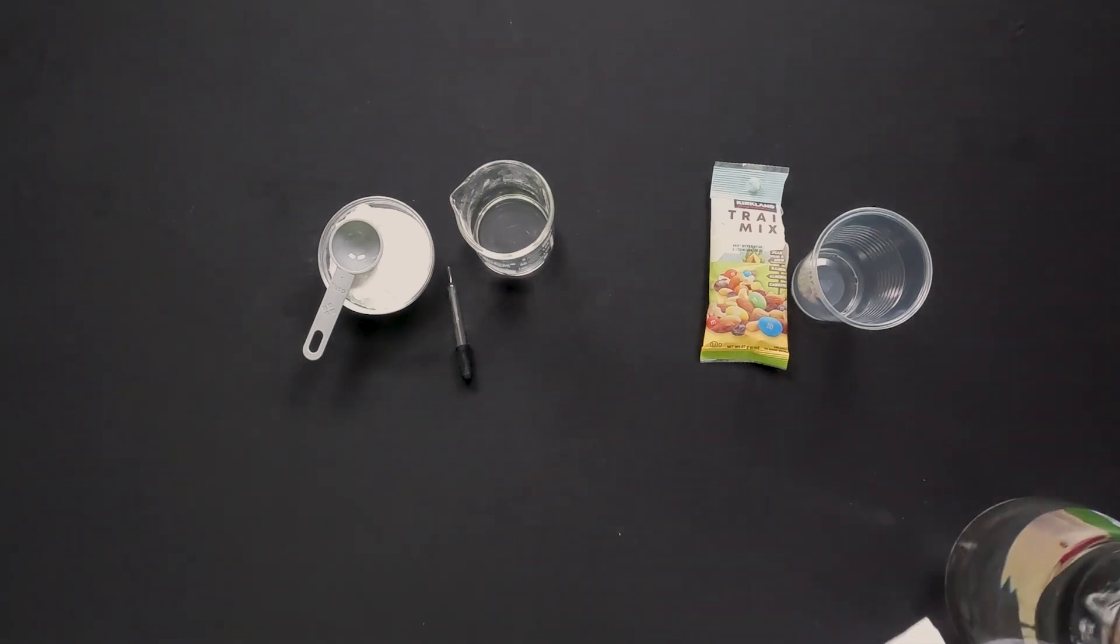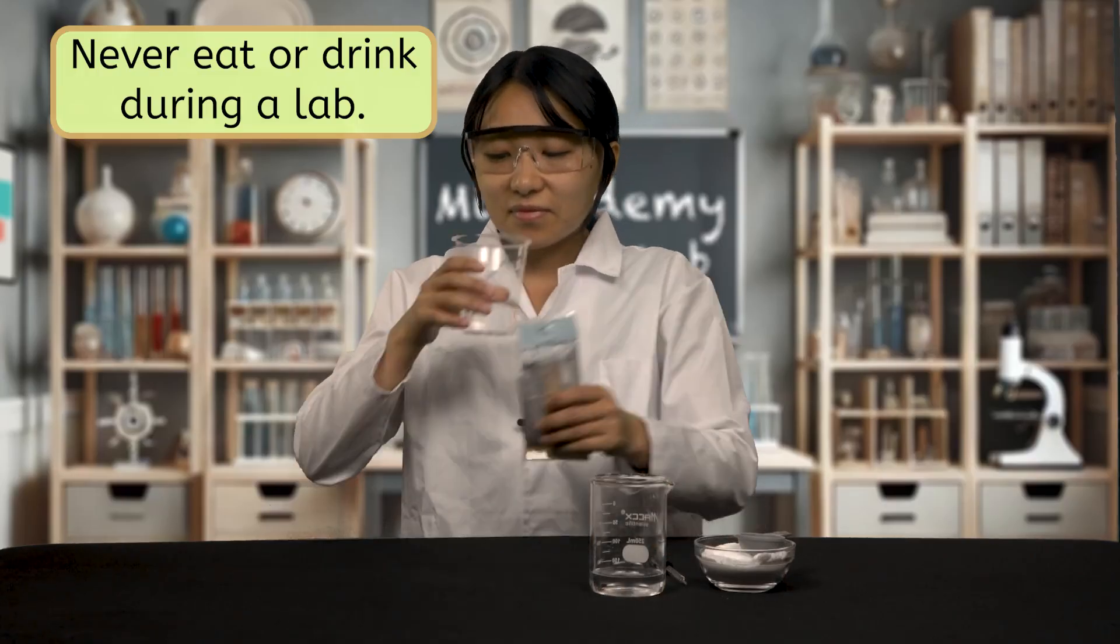Scientists also prevent danger in the lab by never eating or drinking during a lab, especially when chemicals are being used. Even if your home lab is actually the kitchen, make sure all food is put away during your lab investigations and that you clean the area thoroughly and wash your hands before eating or drinking after a lab. Sometimes you may use food or candy in your science investigations. Even if a material is technically edible, don't put anything in your mouth unless expressly instructed to do so. We know that observations can be made with all five senses, but it's a good idea to be careful about how we use those five senses. Unless told otherwise, you won't be tasting in the lab.